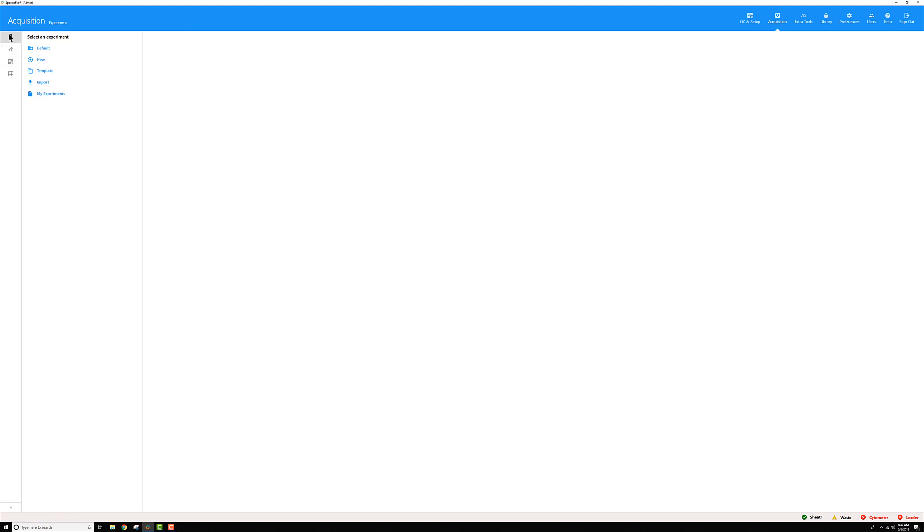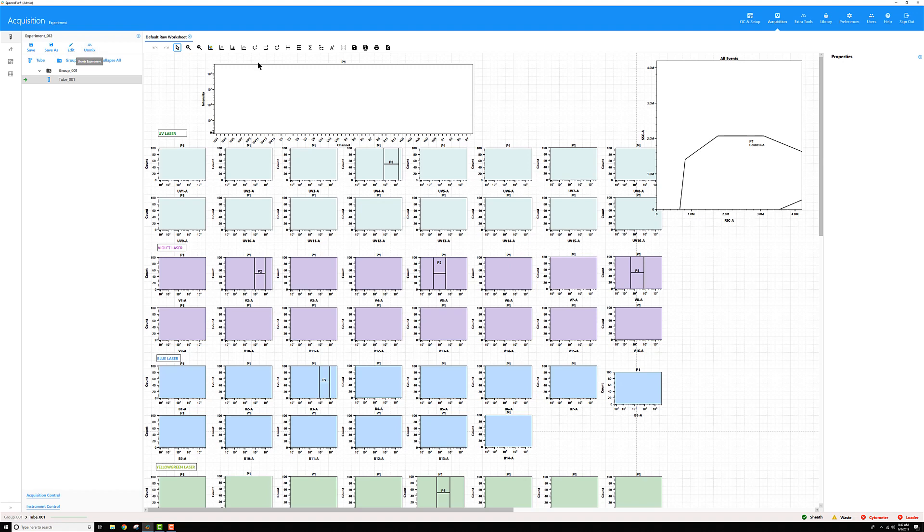And again, you can move from the left to the right. If you want to open a new experiment, I'll click this, and my new default experiment is going to open up in this far right pane.